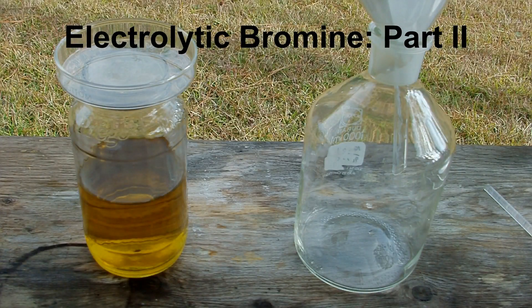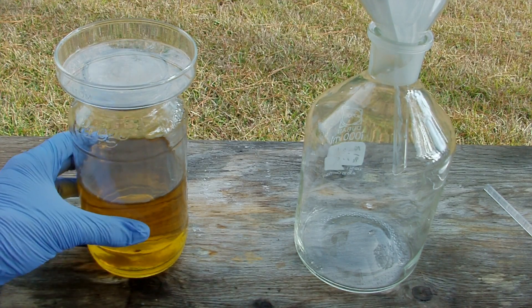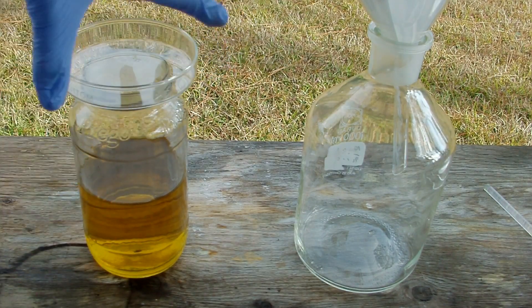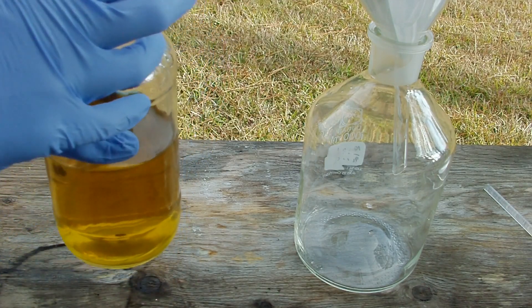After just over 26 hours the electrolysis is finally finished and we've got our complete cell liquor, which should have one sixth of the bromide converted to bromate. The yellow color is still there because of the hexavalent chromium. I've got the top capped off a little bit because it smells like a pool, so that's why I'm doing the rest of this outside.